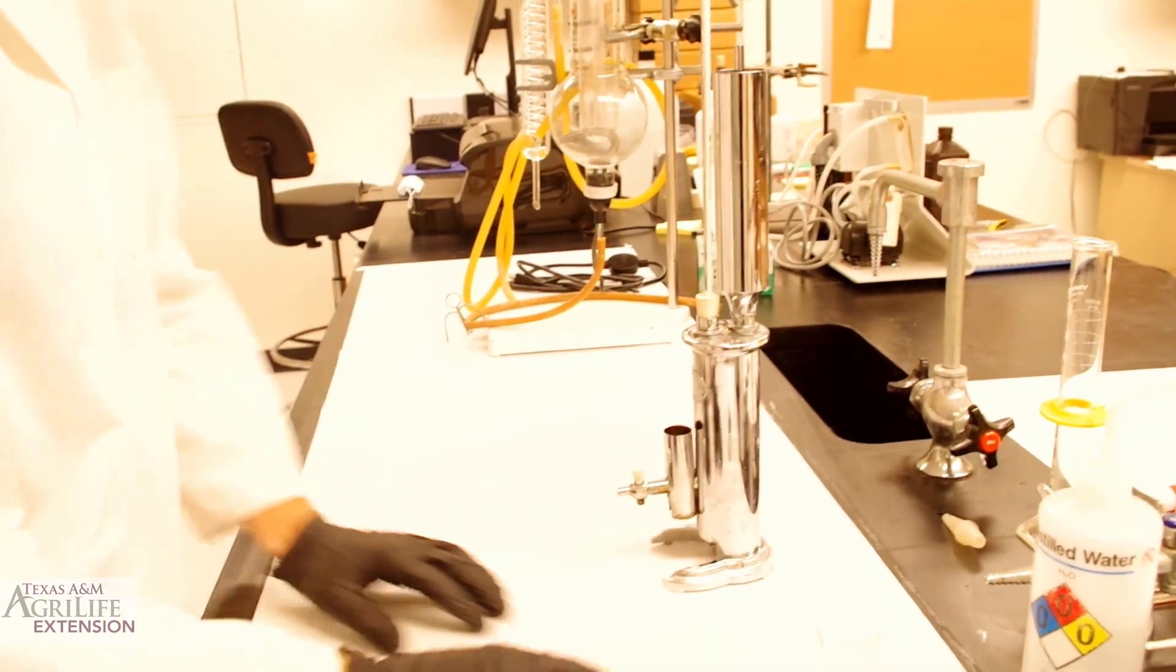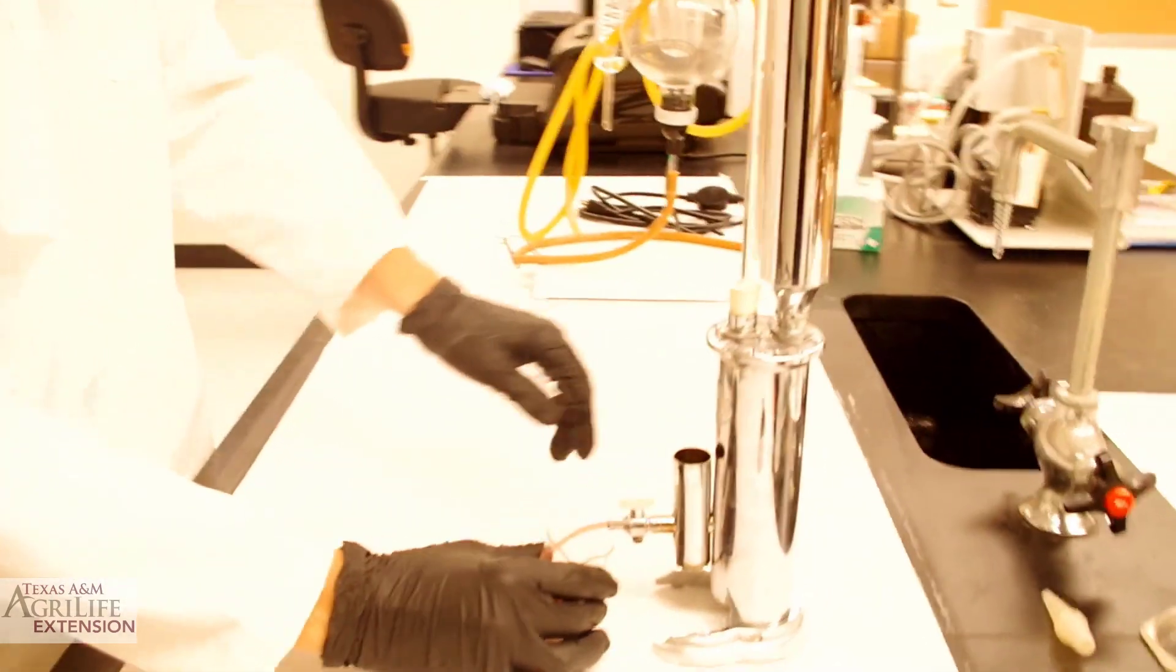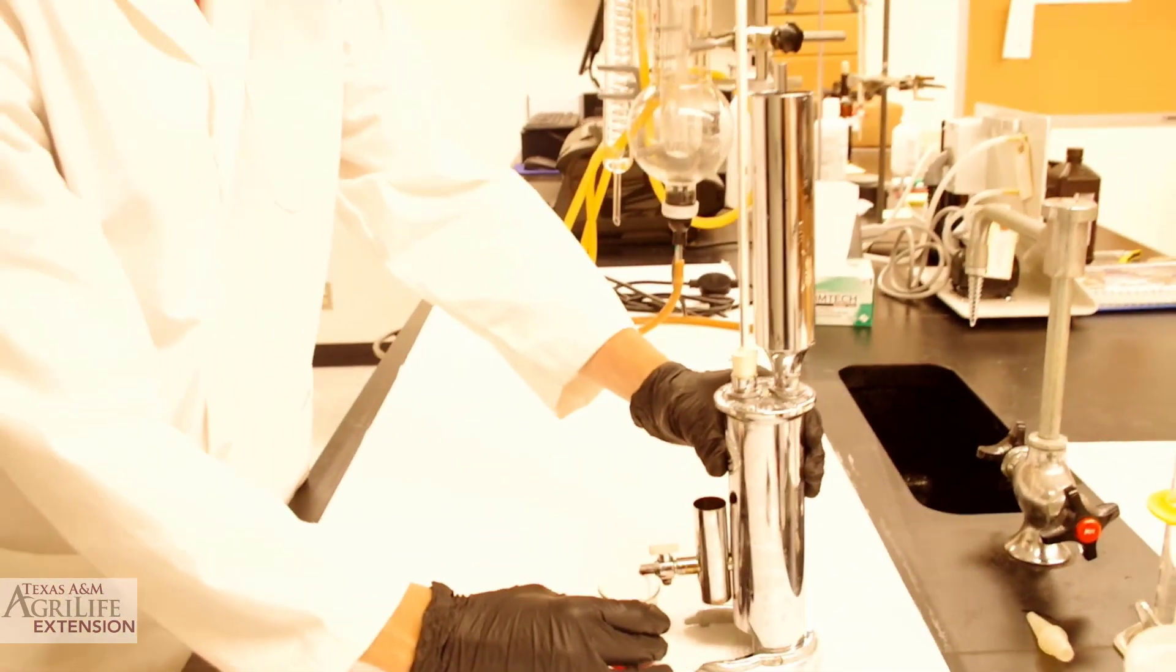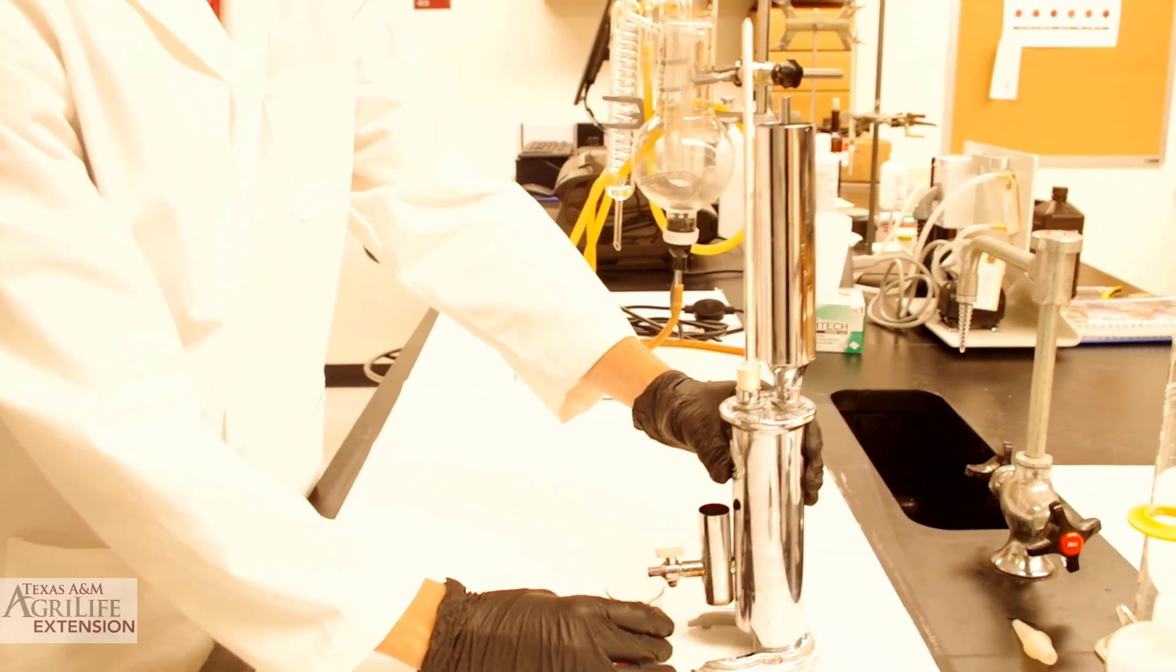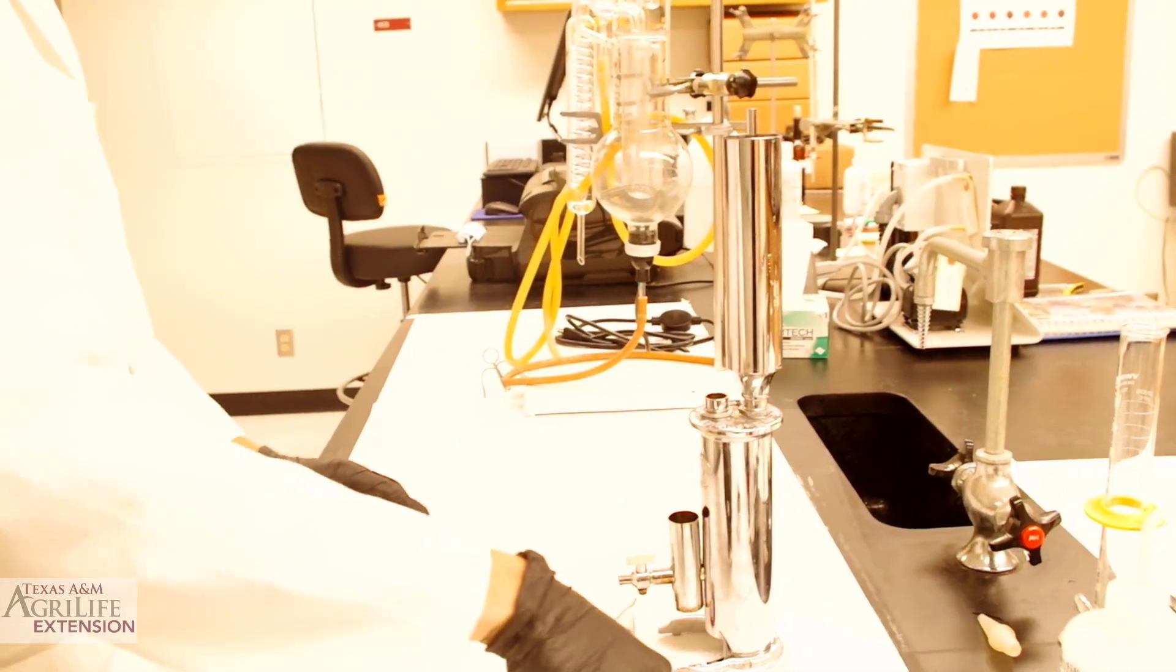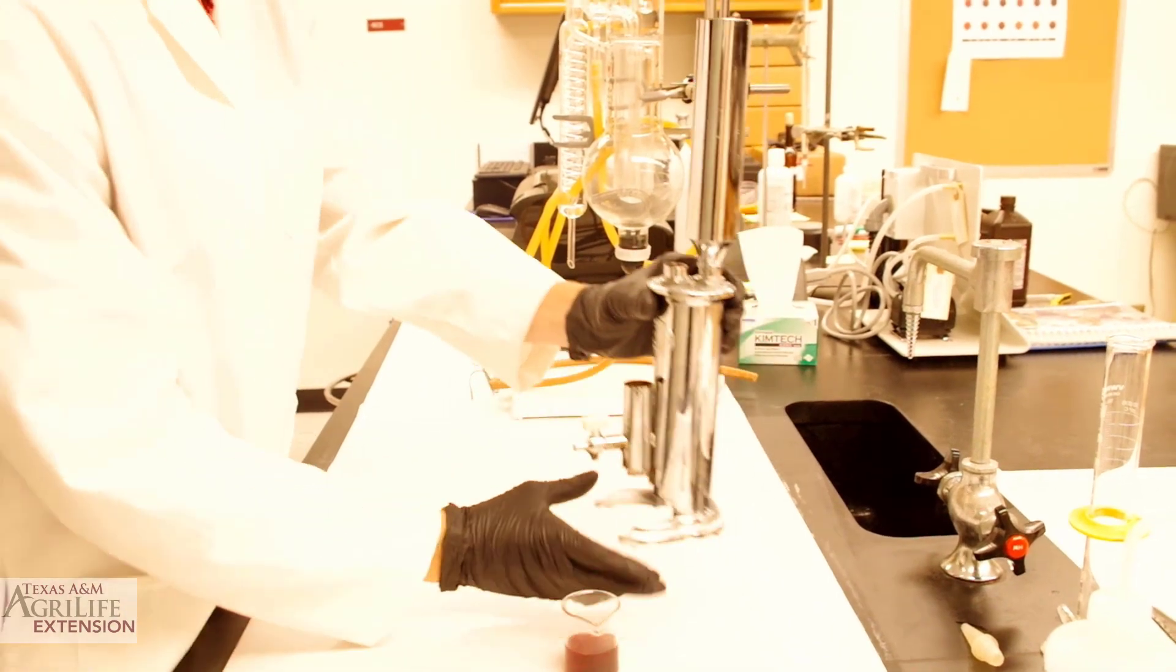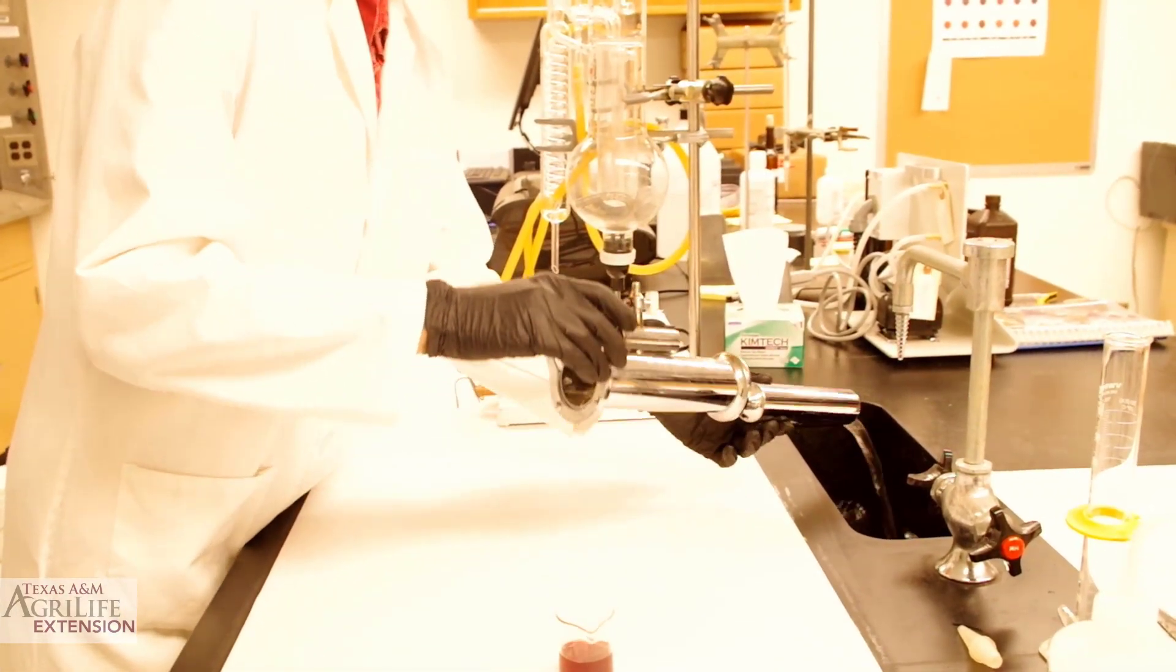First, we turn the burner off. We now can evacuate our sample through the evacuation spout into a waste beaker. Time to remove the thermometer. Carefully drain the cooling water into a sink.